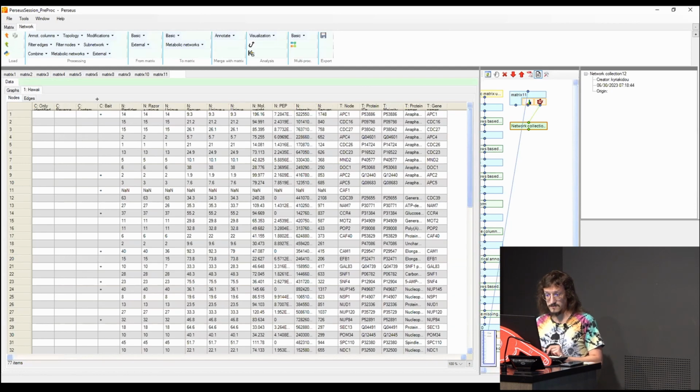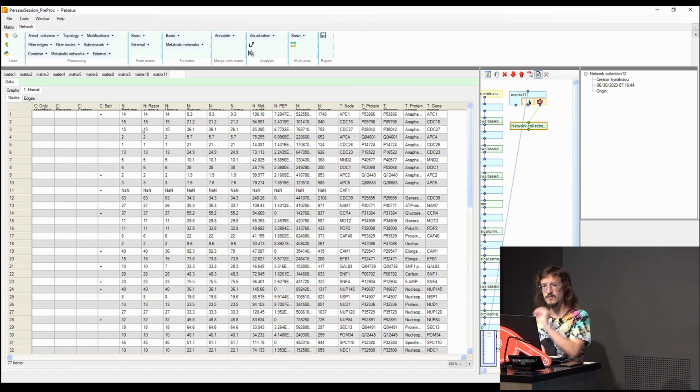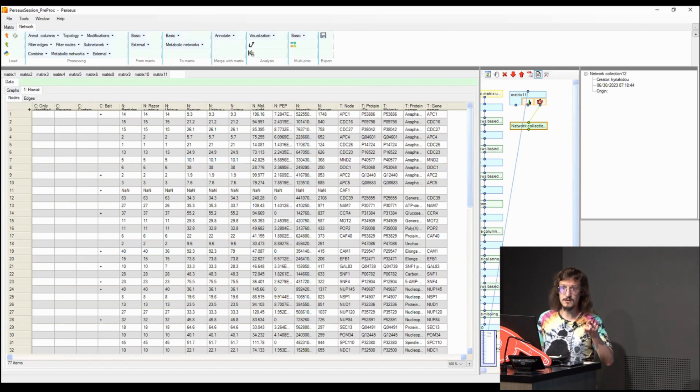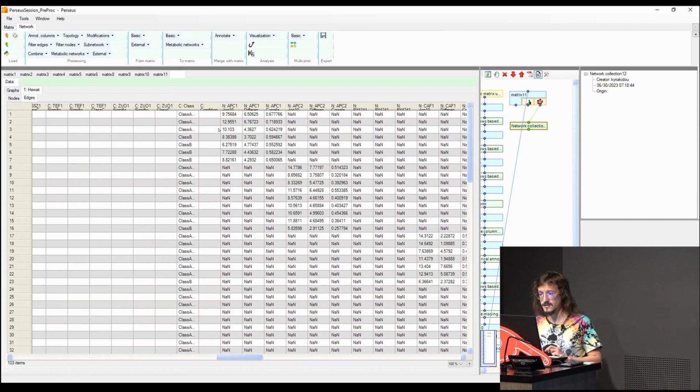The nodes table has information about the baits, and it tells you which node is a bait and which node is instead an interaction. Then you have the statistical information about your node and bait. And on edges, it tells you which of these nodes should be connected together. When they should be connected, there is a plus, and it has its own log fold change with the significance.